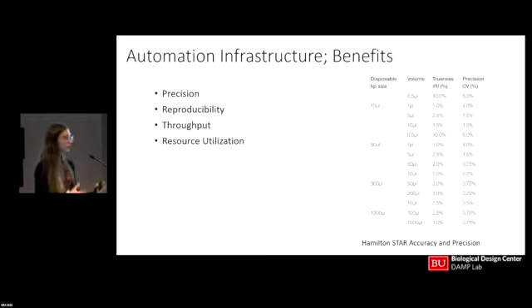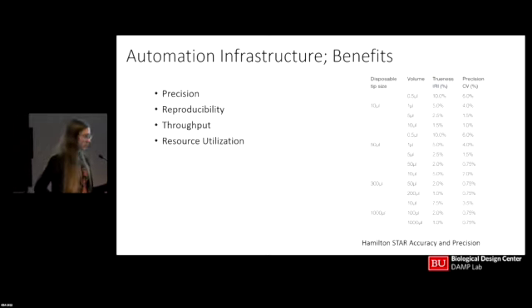So we could have hypothetically put those sample aliquot, RNA extraction, and qPCR all onto one robot, but the throughput would not have been as good. So it was a way to utilize our resources, and also you're able to use your time somewhere else. So someone who develops a workflow and would send it to the DAMP lab doesn't necessarily have to spend all of the time doing it because they send it out to get tested.